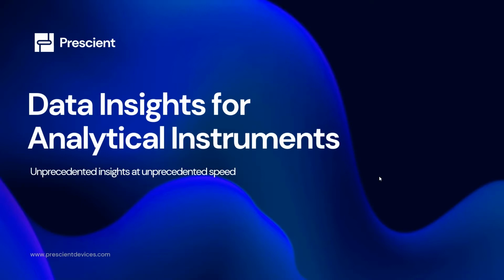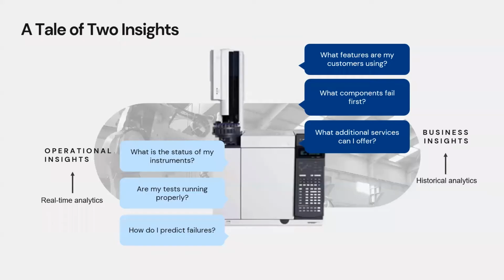When we talk about data insights, we need to distinguish between two types of data insights. The first type is called operational insights, or OI. Those are the type of things that help a customer to improve their operations. Questions such as, are the instruments on or off?